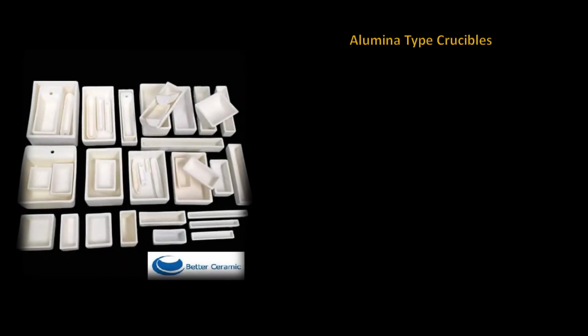There are a number of crucibles used in laboratories. However, there are 10 most commonly used crucibles. The first is the alumina type. They come in many sizes and shapes, such as those shown and manufactured by Better Ceramics. These crucibles are resistant to acids and alkali melts.